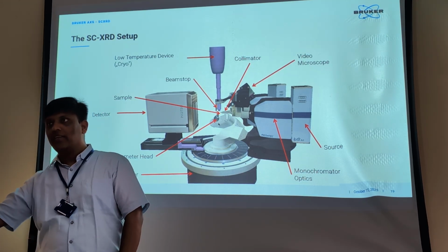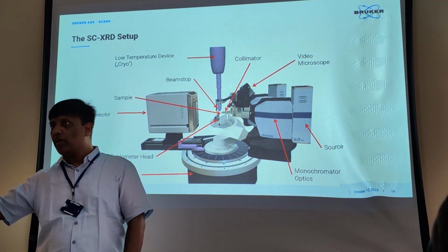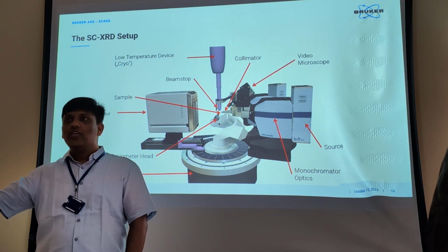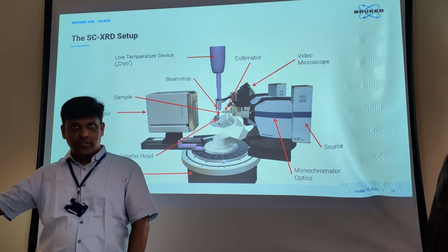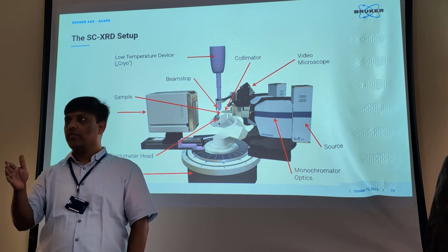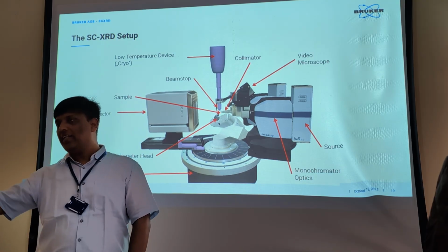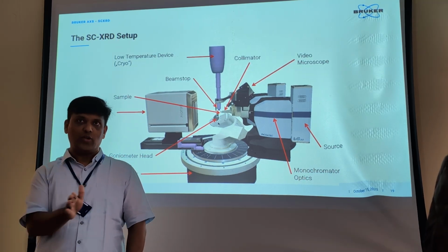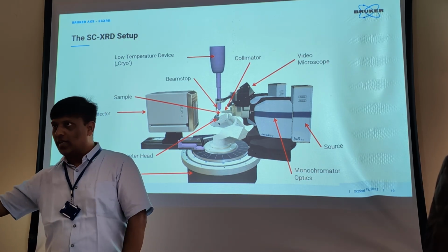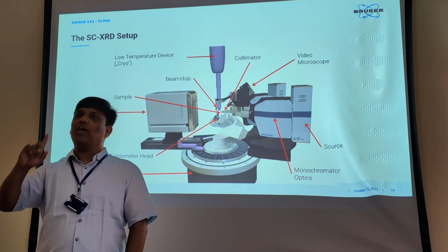If it is 1, then you need to invert and refine it. If it is 0.5, it's inconclusive, so you could not determine it, it's 50-50. To get the value 0, it cannot be just 0, it will be in the second decimal place, 0.0 something. To get that accuracy, you need a very good quality crystal, collected at low temperature with a copper source. So that is the purpose of having copper.